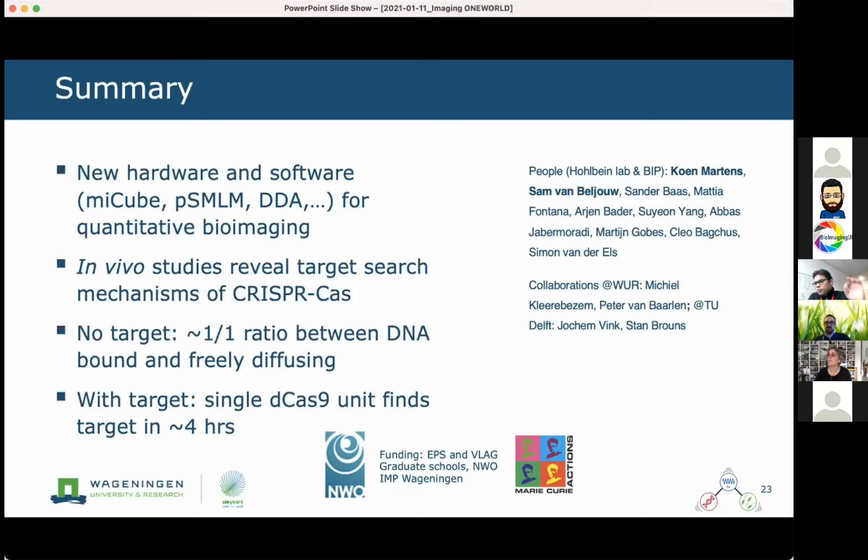You can have only one bead in a whole field of view. Many beads can take averages. So different people report very different things. And given 25 years of bead imaging, we still don't have a standard, right?